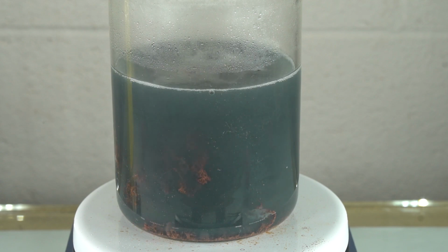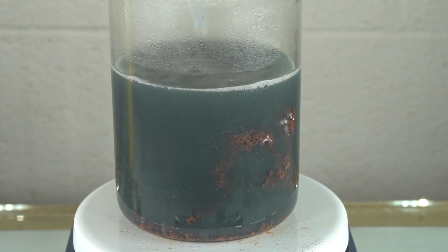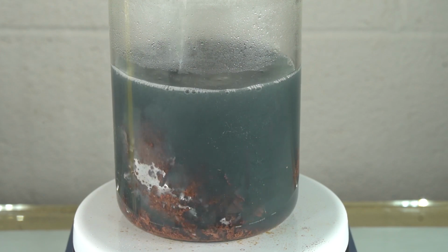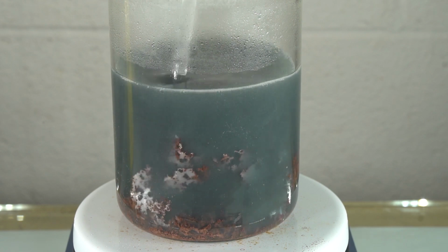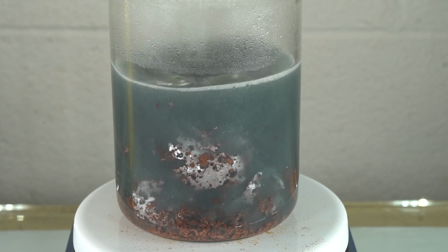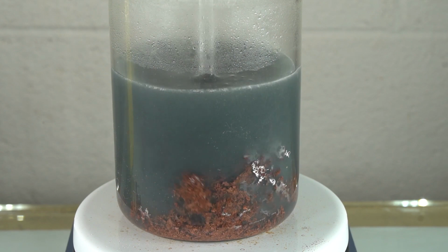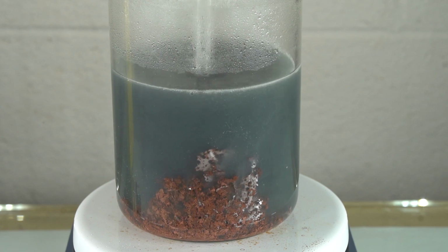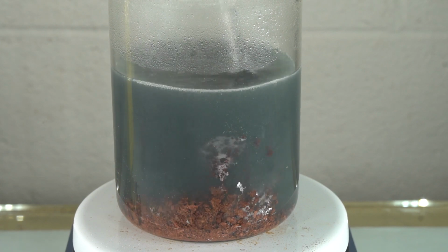There were some large pieces of aluminum foil at the top that I had to push down, but as it converts to copper, it mostly sinks to the ground. So you see the aluminum foil at the top, and we're getting a nice amount of copper. There's some aluminum in there, but I really don't think this is going to take all that much longer. You can see that there's a really, really nice amount of copper forming, and it all is going to the bottom, and that is pure copper metal. It's such a nice red brown. It's such a beautiful element.